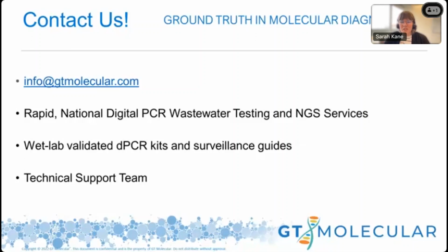Okay, so David says he's used the Ceres beads and they work well. I guess I was wondering if you have a universal extraction method for viral and bacterial targets. And this is also, again, something that keeps me up at night and that we're actively working on, because there's going to be some bacterial targets that are quite a bit more stable than others. So what we're envisioning right now is that there's probably going to end up being two workflows. One that involves bead beating of C. auris and some of the AMR targets. Maybe even Campy needs bead beating. We're not entirely sure yet.